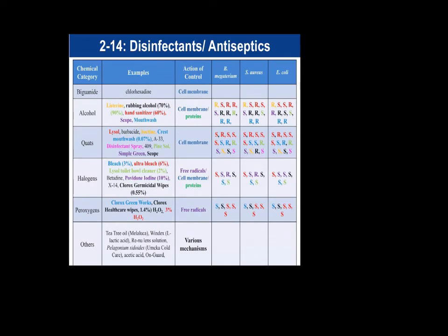So this is a chart that is in your notes, and I know it looks like a mishmash of colors and symbols and chemical names. So let's break this down and I'll explain what's happening here. We have taken our results from our plates and we have measured that 2 millimeter zone of inhibition. If it is less than 2 millimeters, it's resistant, or R. And if it's greater than 2 millimeters, it is sensitive.